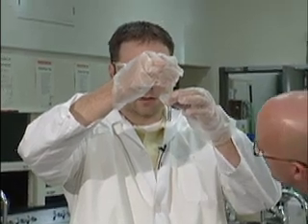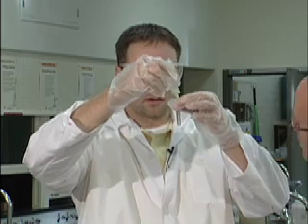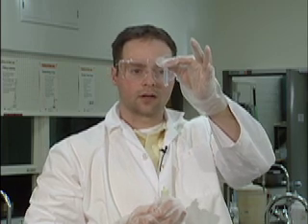So we add in our nitric acid, and I'm seeing cloudy. Voila, we get a white cloudy precipitate formed. Sorry, Jeff. Well, I can see it. A white cloudy precipitate formed in our solution. So that tells us that we definitely have silver. We have a silver cation.